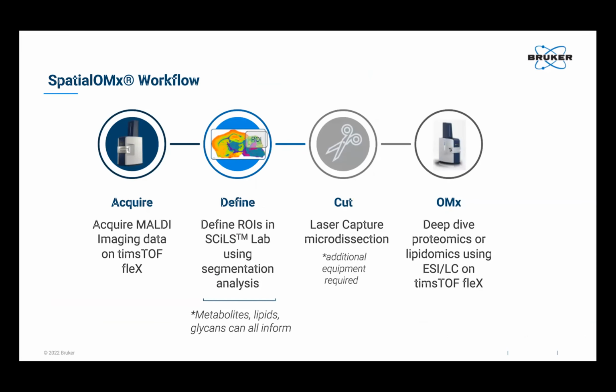All right, so then I'll move into a handful of the workflows that we have that are accessible, and ways to utilize your instrument to the best of its possible capabilities. This is what we call our SpatialOMx Workflow. We're going to combine MALDI imaging with a full proteomics or metabolomics experiment in order to figure out where I should be looking to do the deepest dive of proteomics possible. That's part of the struggle.